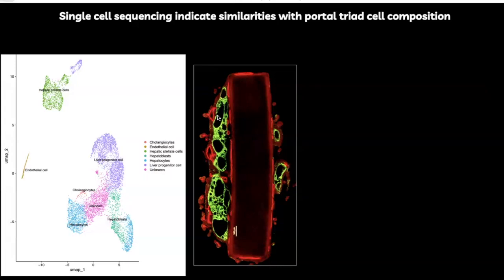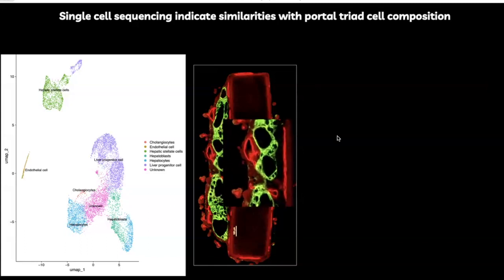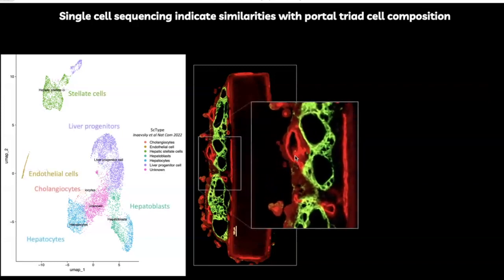And now, away from the bile duct, on the other side of the bile duct, you have these lumens here. If I zoom in, you have lumens, and these lumens are also positive for VE-cadherin. And so they are also lined with endothelial cells. So we think that they represent either kind of veins or kind of arteries. We don't know yet which sort of lumens they are exactly.